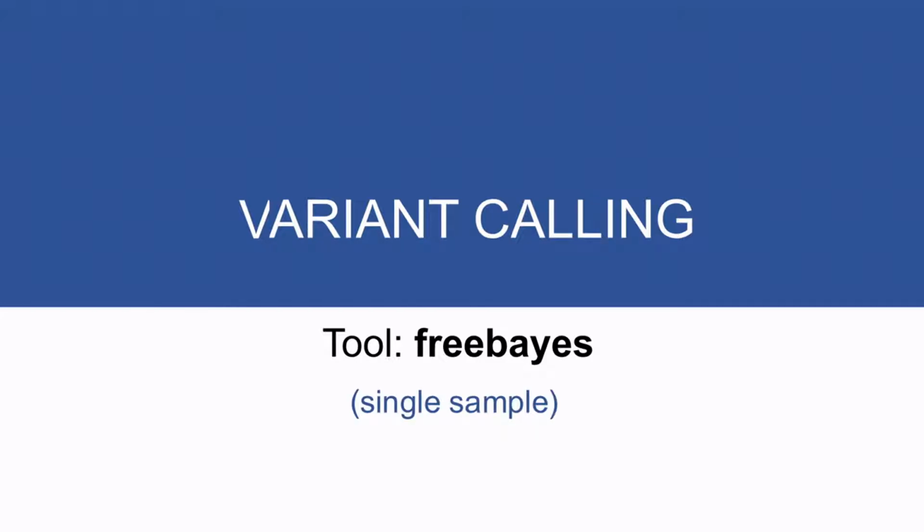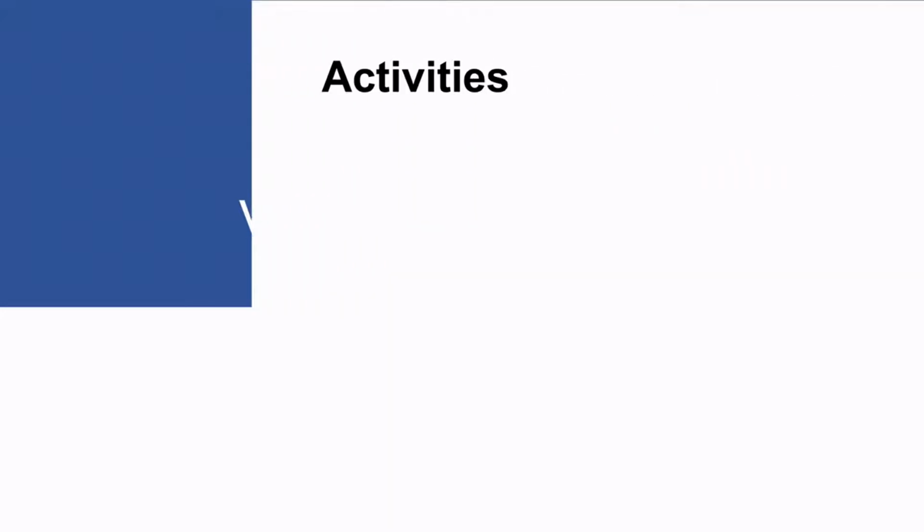In today's video, I am going to show you how you can call variants using the tool freebayes. For this tutorial, we are going to use a single sample. These are the activities we perform in this exercise.